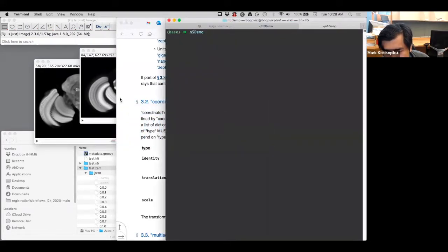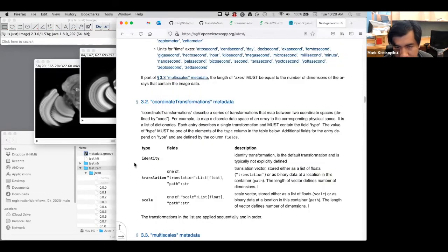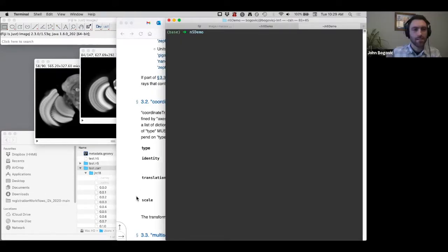Meanwhile, I think Bill had a question about partial block writes, and if there's a transactional issue, if you have multiple threads trying to work on the same data set. So how do you make sure that more than one worker or thread doesn't try to open the same chunk and write to it simultaneously? Yes, that is the developer's responsibility. And right now we let you be irresponsible. If you use methods, at least in our libraries, that could cause potential conflicts, it is the developer's responsibility to not run them in parallel.